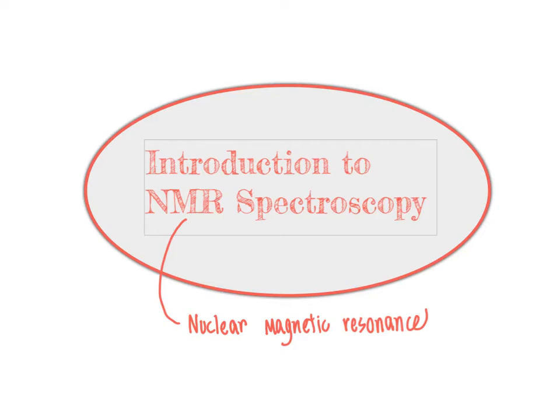So when we are looking at an NMR spectrum, there are a variety of different types of NMR experiments that we can run. In the next week's videos, we are going to get into a variety of different types of NMR experiments and how to interpret those NMR data to come up with the complete chemical structures of molecules. Those will include 1D NMR experiments such as the proton NMR spectra that you likely interpreted when you took organic chemistry. We will also get into two-dimensional NMR spectra that allow us to determine such things as which atoms are connected to one another or which atoms are close in physical space to one another.